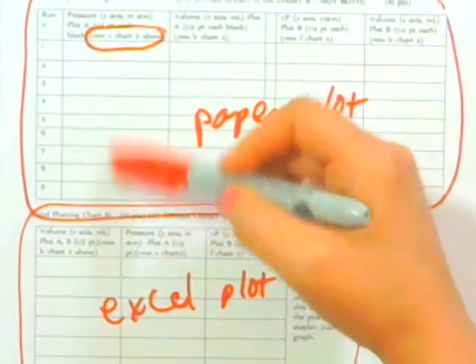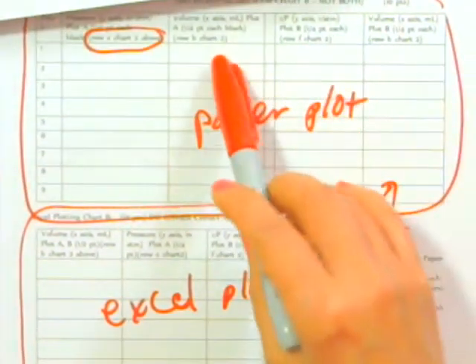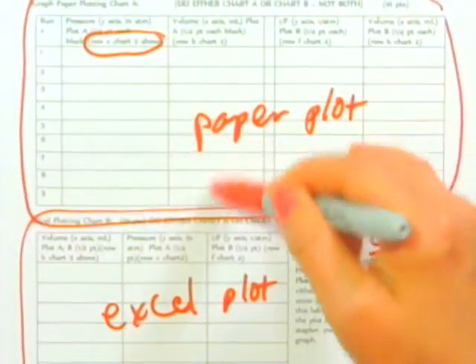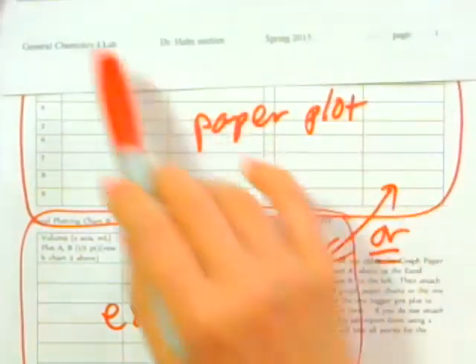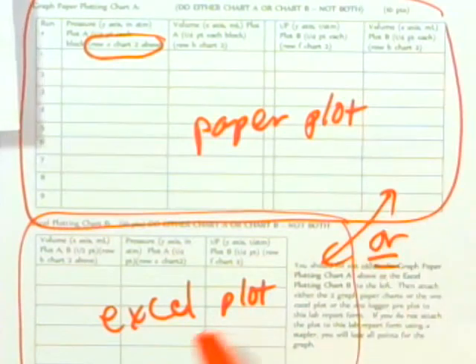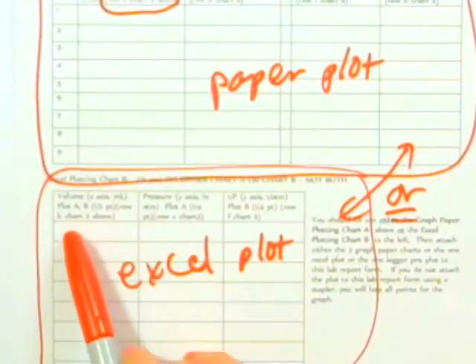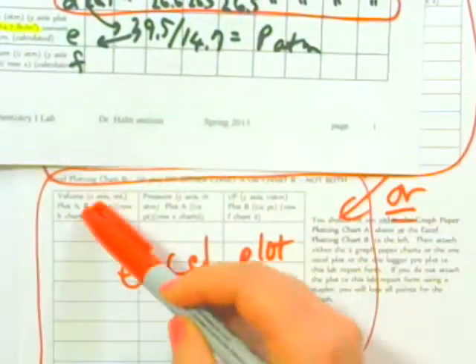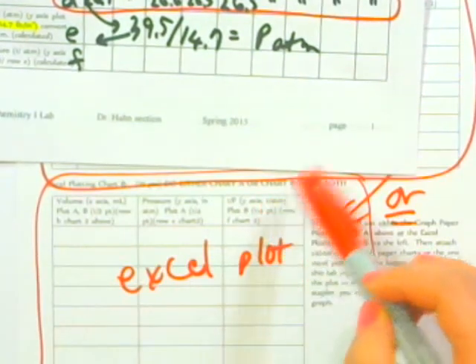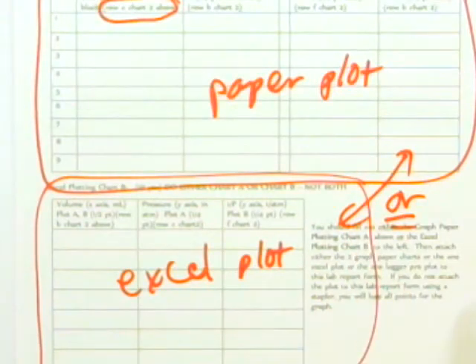Whatever number you get in row E is going to go here. And whatever you have in row B, right here, is going to go here. This is going to be row F, so 1 over P is going to go here, and this is going to be row B of chart 2. Right here, you've got row B of chart 2, so row B of chart 2 goes here, row E of chart 2 goes here, and then row F of chart 2 goes here. So these are the numbers that you're going to use for your Excel spreadsheet plot.